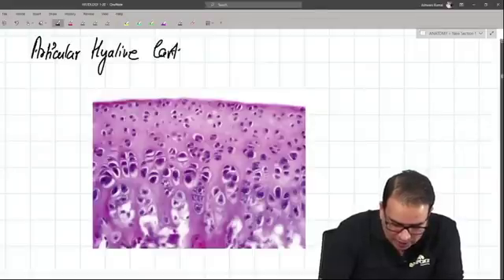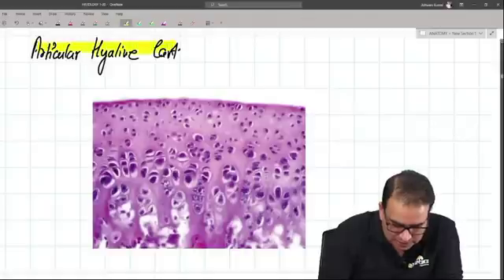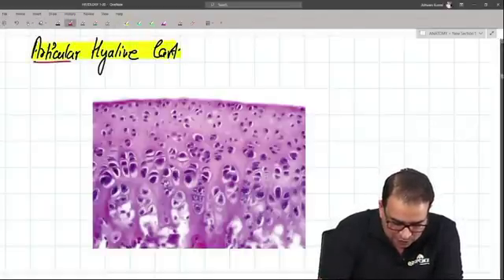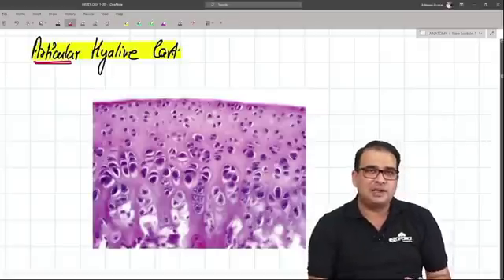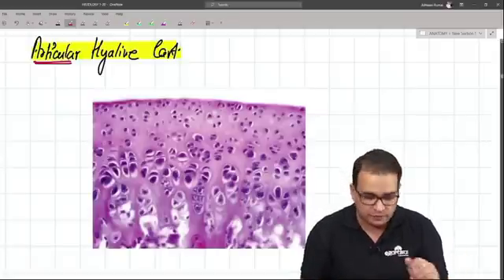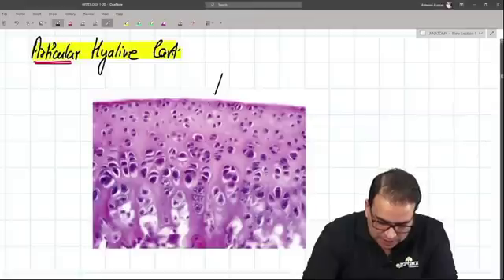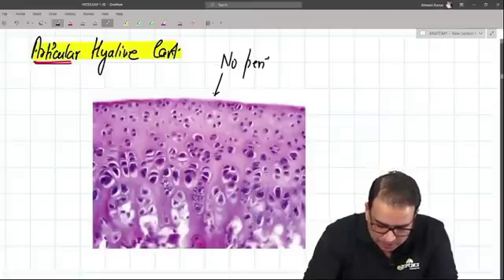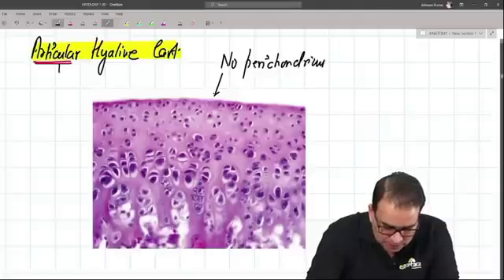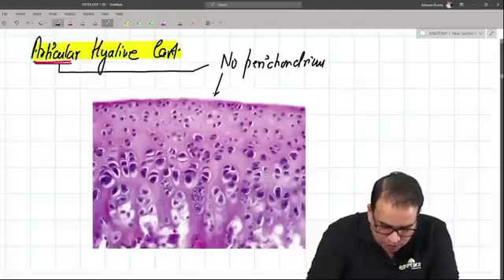This is a slide of an articular hyaline cartilage. The reason I'm stressing on the word 'articular' is because a normal hyaline cartilage and an articular hyaline cartilage will vary in a few points. Number one: there is no perichondrium, and that is because it is articular.